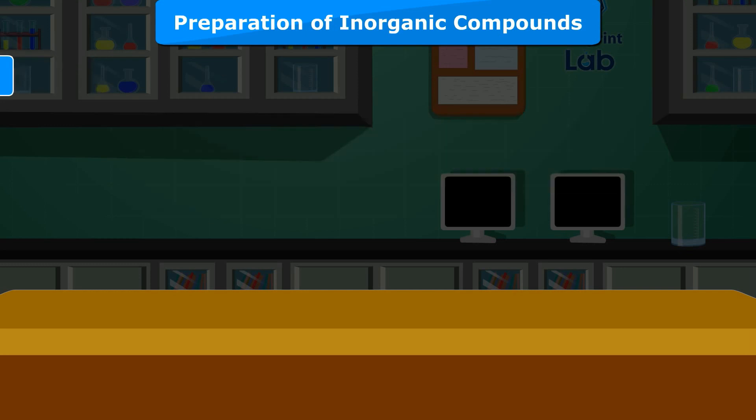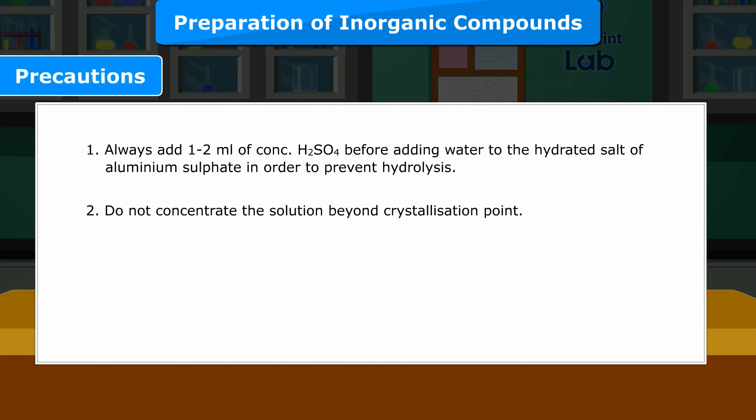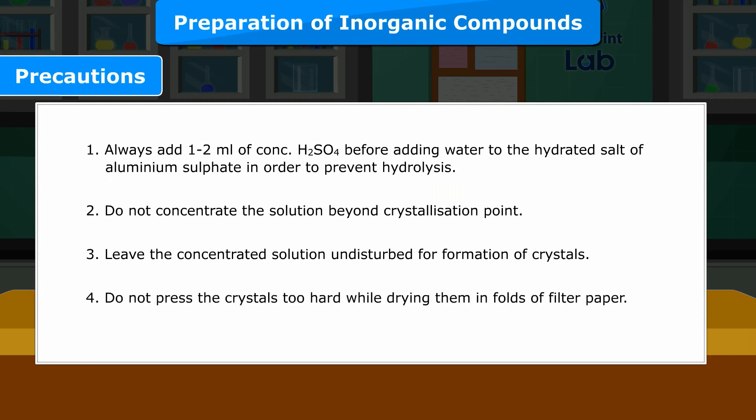Precautions: 1. Always add 1–2 ml of concentrated H2SO4 before adding water to the hydrated salt of aluminium sulphate, in order to prevent hydrolysis. 2. Do not concentrate the solution beyond the crystallization point. 3. Leave the concentrated solution undisturbed for formation of crystals. 4. Do not press the crystals too hard while drying them in folds of filter paper.